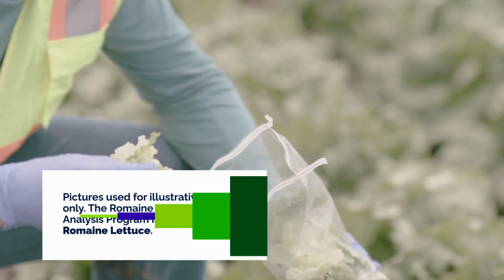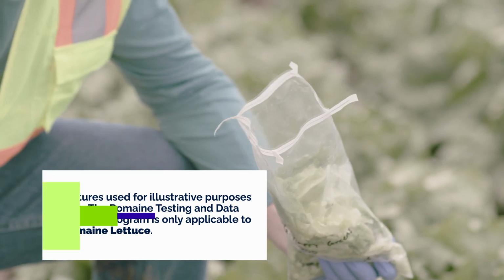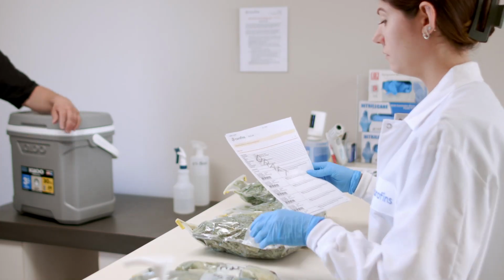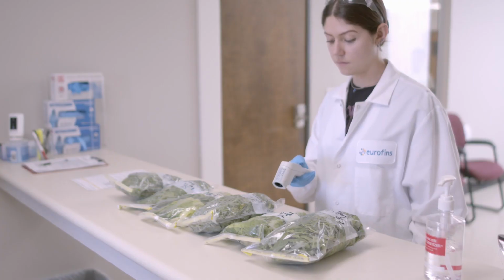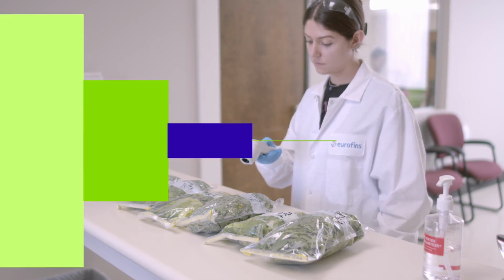Samples can be taken by a third party as part of the laboratory service, by a sampling service provider, or a company's properly trained employee. Then, the laboratory must process the sample as you have defined it. It is mandatory that the entire weight of the sample is analyzed.